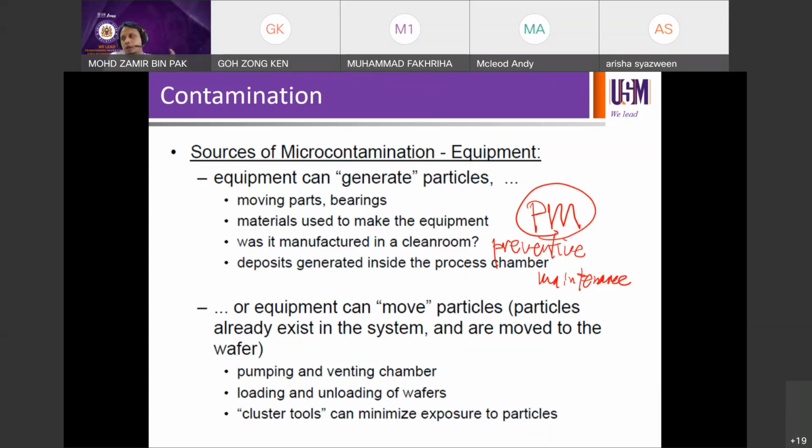So the longer the period is between the specs, say weekly, maybe you need like 1 hour to get everything done. Monthly, you probably need 4 hours, for example, depending on the equipment. So if you go for longer PM, yang lebih rare, yang less frequent, then it's going to be longer and longer. Quarterly PM, say 18 hours, semi-annual perhaps 2 days, annual PM perhaps 4 days.